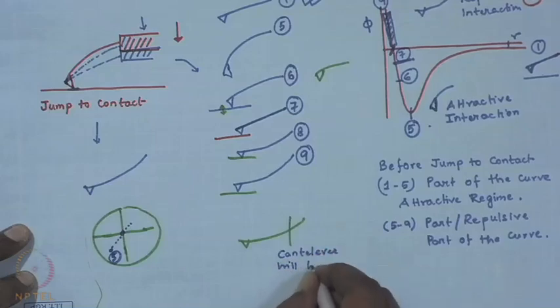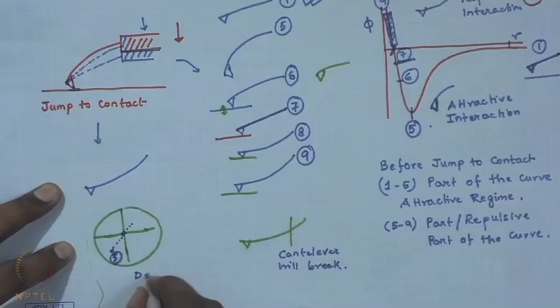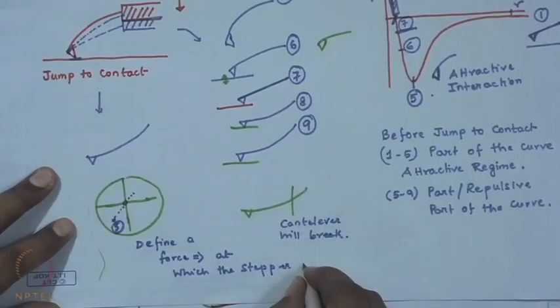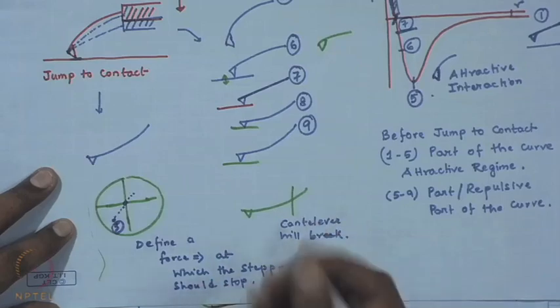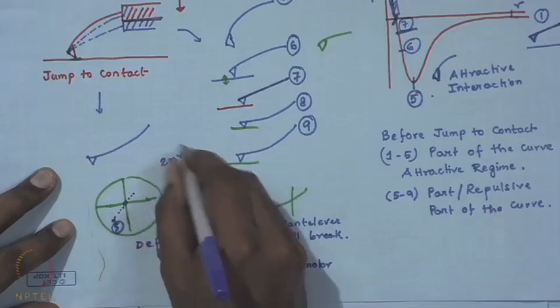So, what needs to be done is that you need to define a force at which the stepper motor should stop. Okay. And that force can be, let us say, 2 millivolt, 3 millivolt, whatever it is.